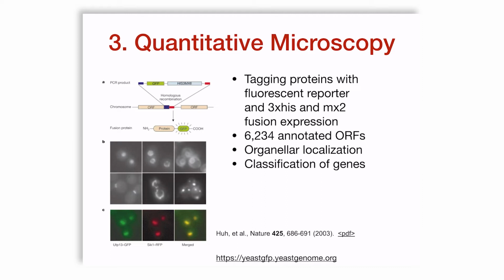Whereas this sort of microscopy can give you a whole time series or a spatio-temporal map of the molecule of interest. Typically, this has been engineered using a tool which was developed after the discovery of the green fluorescent protein. We have spoken very briefly about GFP as a typical protein.